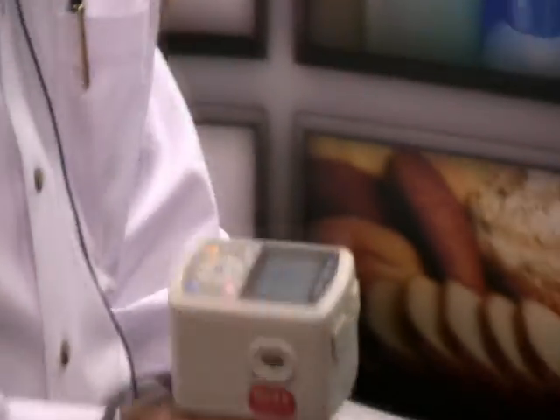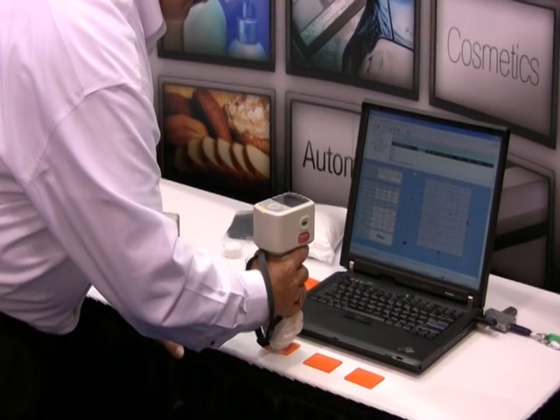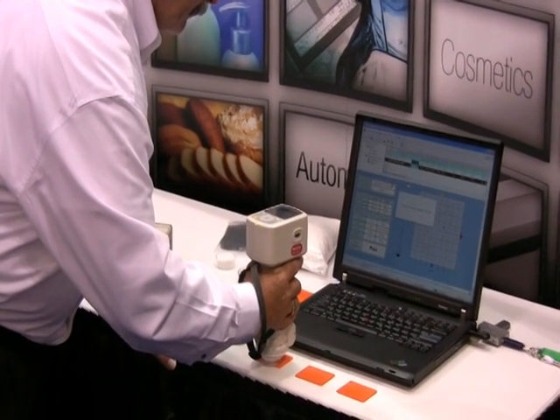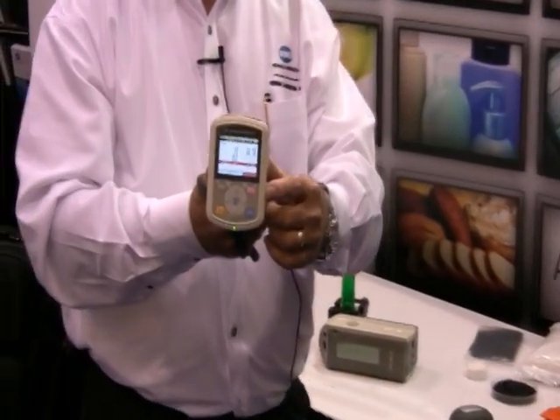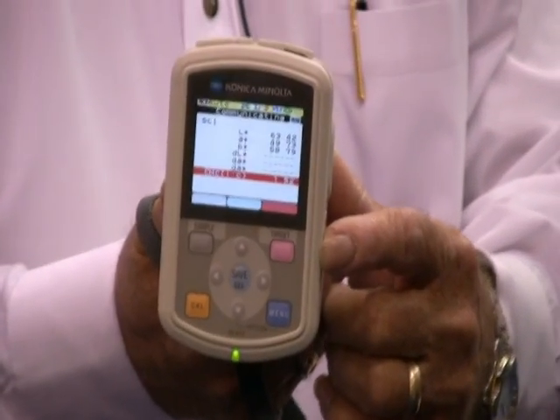Now I'm going to measure another sample to see if this also is an acceptable match. In this case it's not. It indicates red, which means it's outside the acceptable limits for this particular customer.